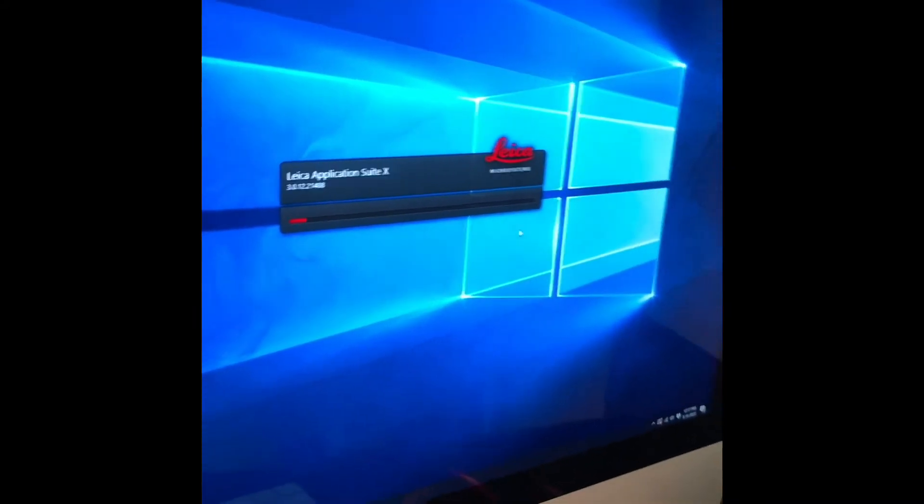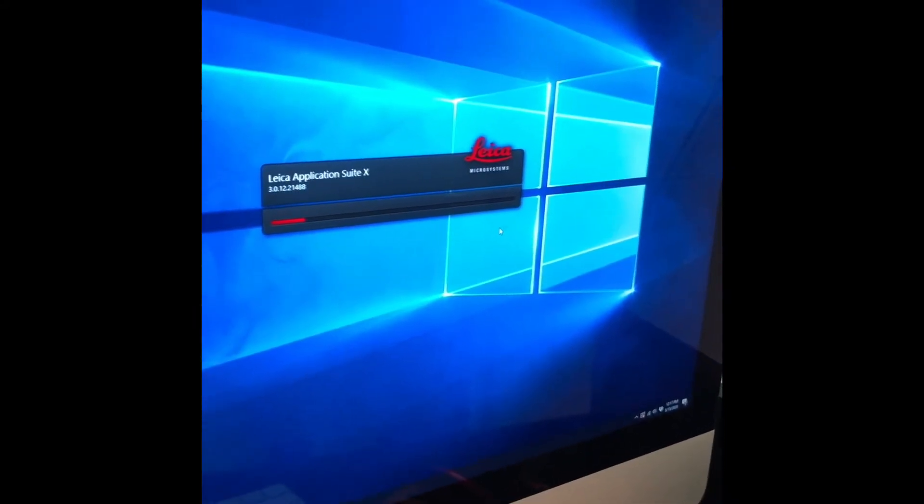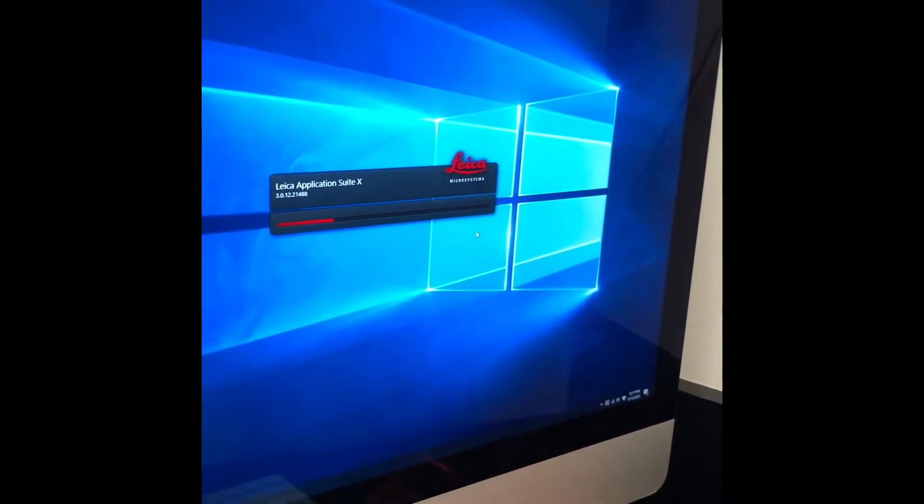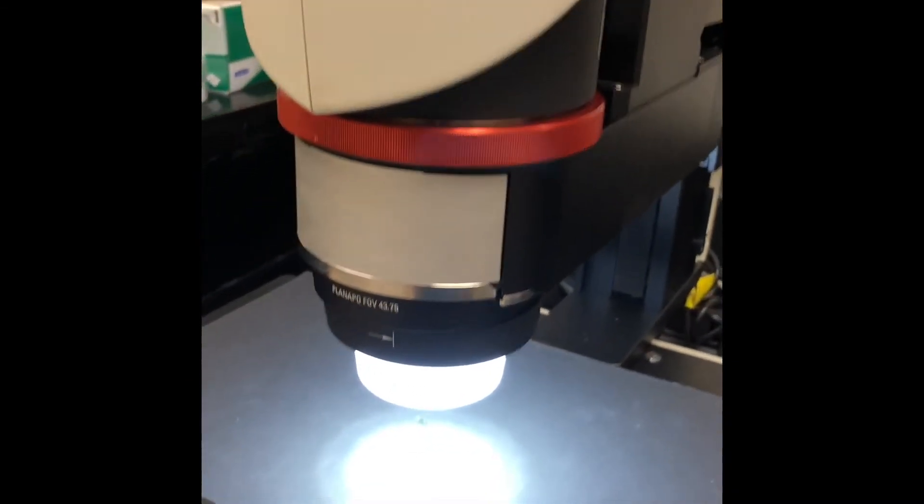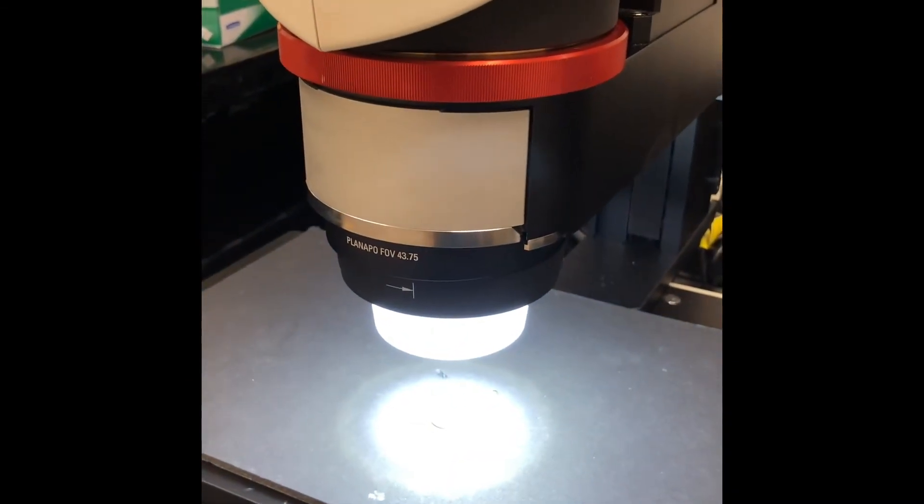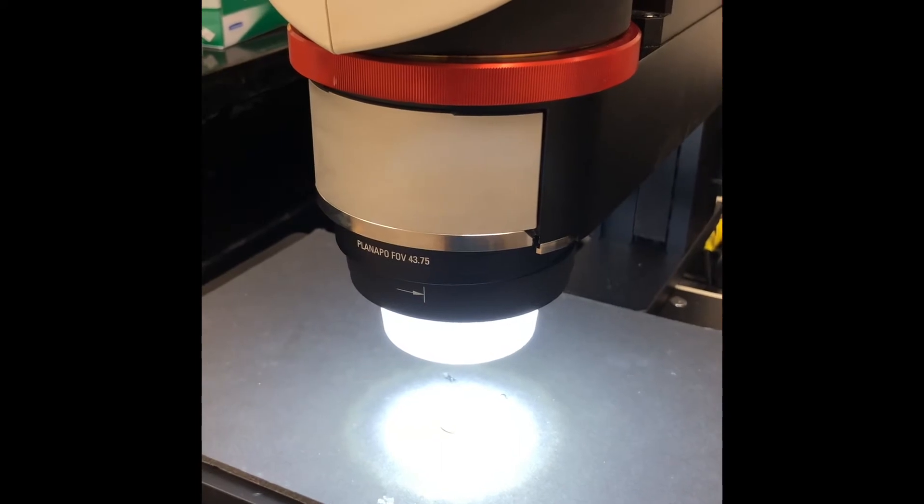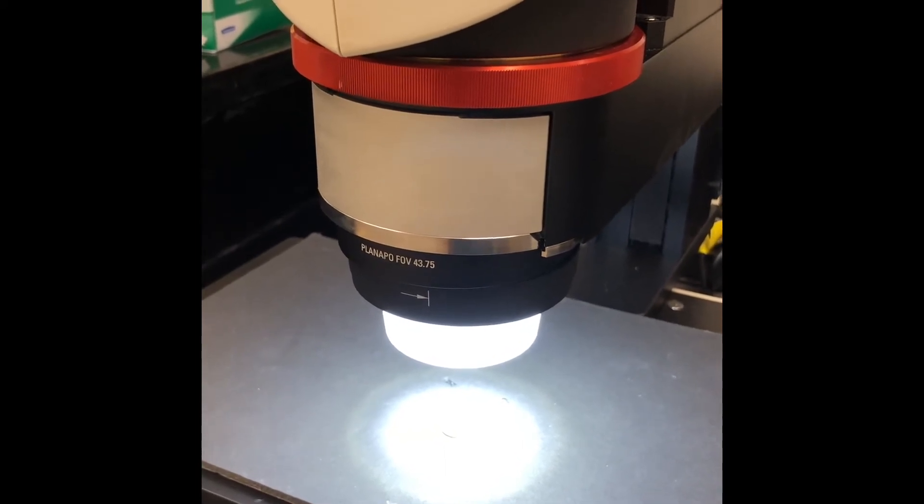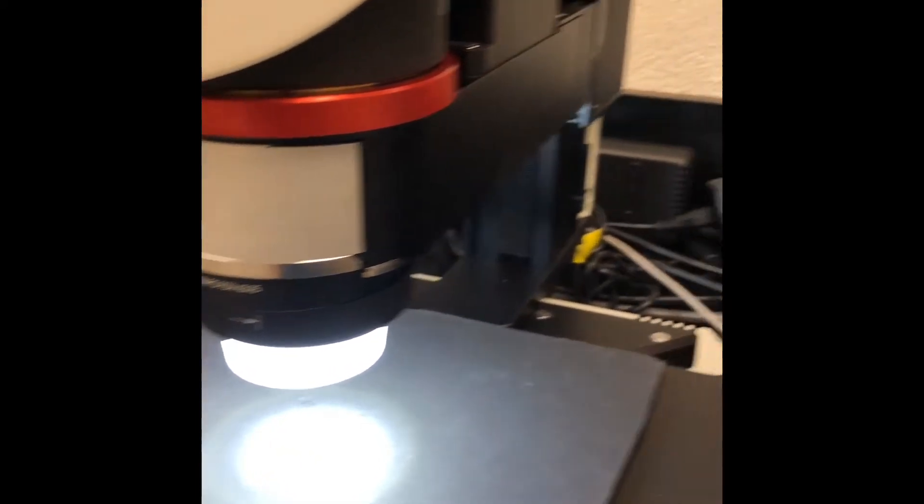After you've hit no on the Z-clamp height adjustment button, you'll see that some light should be coming through the microscope at this point.